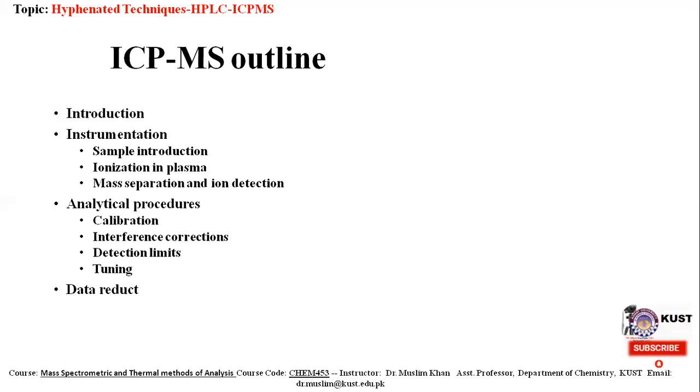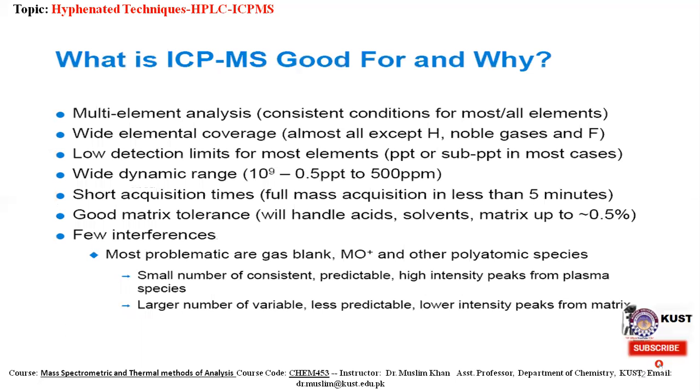Last, data reduction: how the data is carried out, presented, and processed, and sample preparation and lab safety. And at the end, we will discuss this ICPMS system.